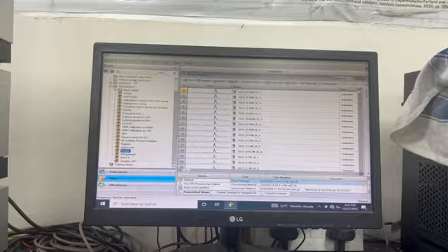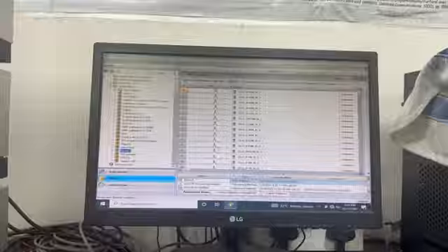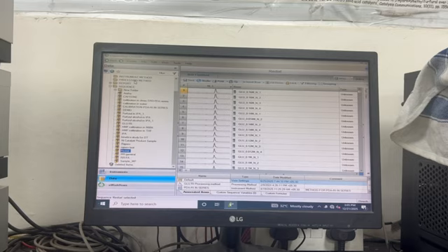The next one is our sample itself, right? The sample to be analyzed is the sequence, so we can create a sequence also. That sequence will use this instrumentation method and this processing method. Okay, then the next one is the report.